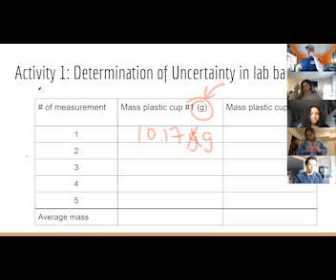So in the lab, when we're measuring the mass of something, the balance has a cover over the top of it. And you can probably make one if you had a box that you could see through, like a lucite box or something, and put the lucite box over the top. That would prevent air from moving around in the room. Just waving my hand over the top of it is changing the mass dramatically. So that is why you want to wait and see when it stops changing, and then write it down.